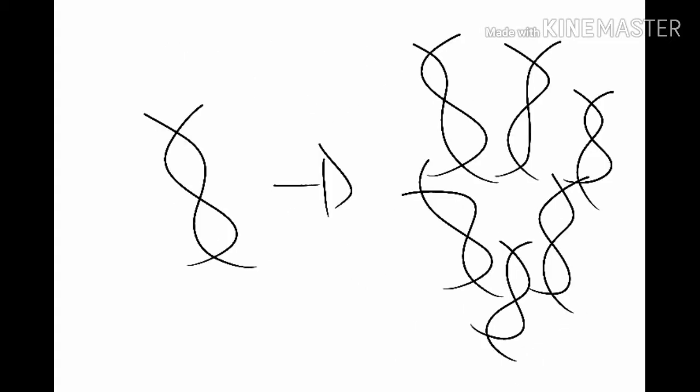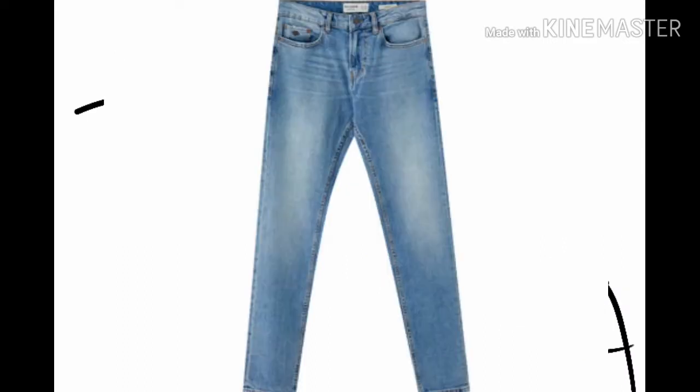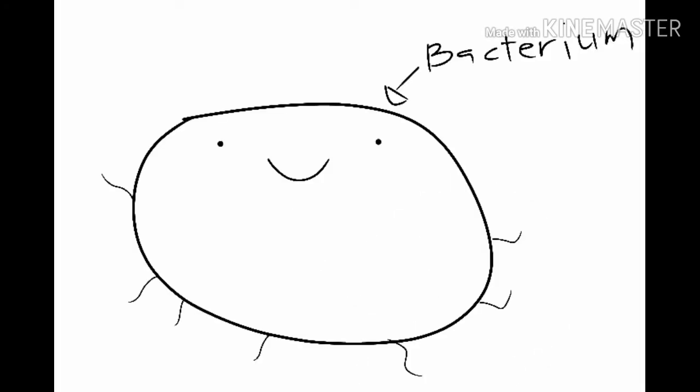Transformation and selection of bacteria are key steps in DNA cloning. DNA cloning is the process of making many copies of a specific piece of DNA, such as a gene. The copies are often made in bacteria. In a typical cloning experiment, researchers first insert a piece of DNA, such as a gene, into a circular piece of DNA called a plasmid.